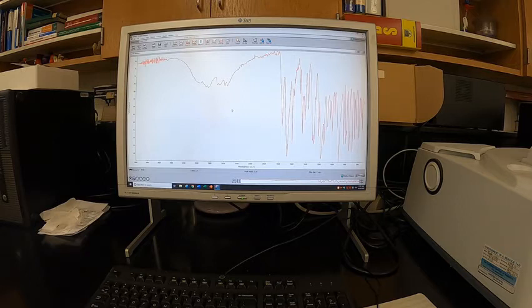So what I'm going to do for you is, I'm going to have a copy of this spectrum in the actual lab handout that goes with the experiment, so you can refer to it for data acquisition. What I wanted to do was at least show you how the instrument works and how we acquire the spectrum and what you can do with the data. So again, we'll learn a lot more about IR spectroscopy in the class, and in due time, looking at a spectrum like this, you'll instantly know what kind of compound it might be or might not be.